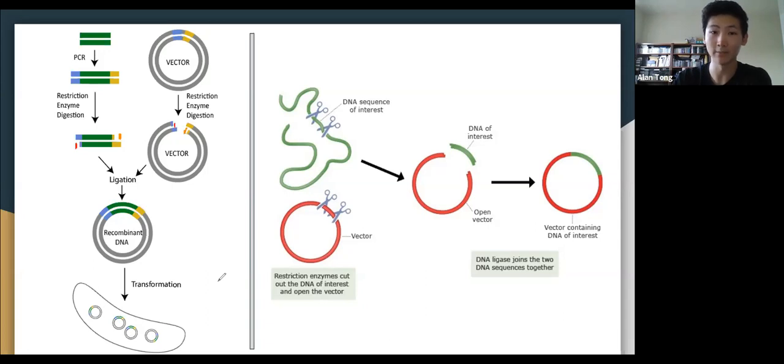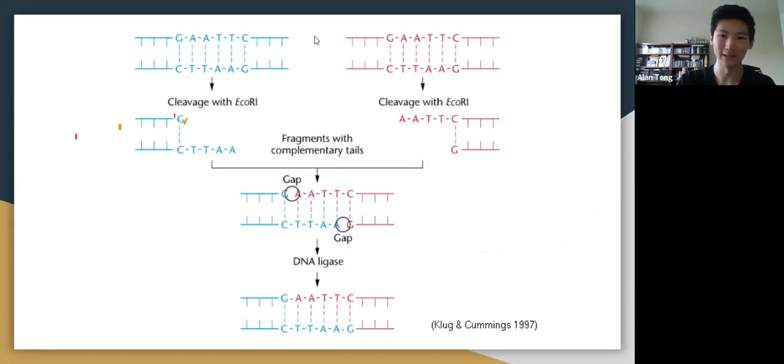And on this side, it's showing the same thing, but on a more close-up scale. You have these molecular scissors. People call restriction enzymes molecular scissors. You can chop through a very precise sequence, and then you can ligate it to your plasmid after chopping the plasmid up with those same scissors. And then you have your complete plasmid. Okay. So this is genetic engineering. We are inserting whatever gene. Think about how powerful this is. Choose any gene you want. You can put it into a plasmid. You can put it into a bacteria. That bacteria can then start doing your bidding.